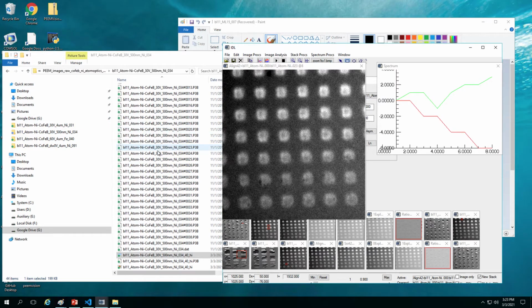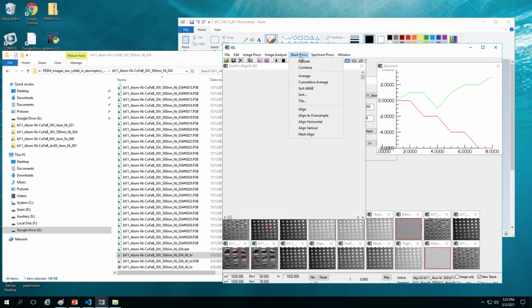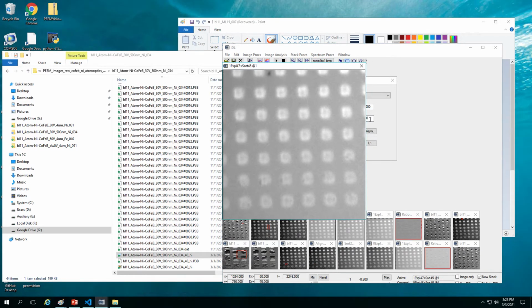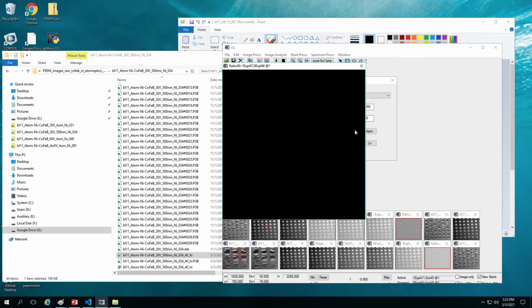Yeah, you want to write on your notebook which folder and how many images we're going to low and how many go to high. Okay, so that's done. We explode and divide.